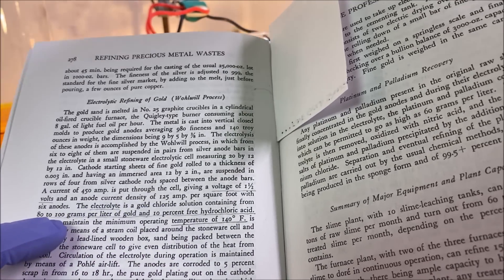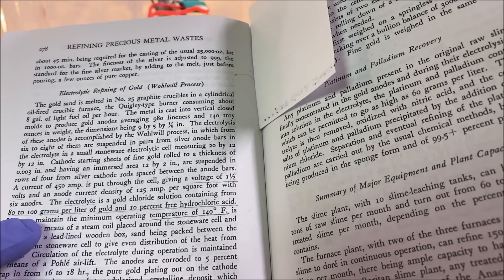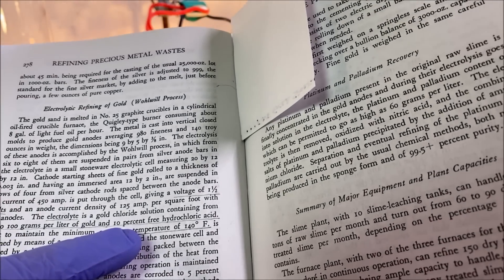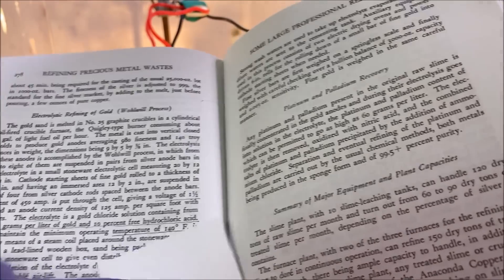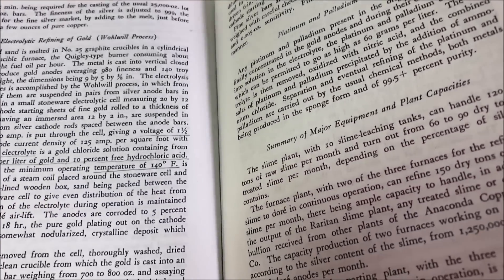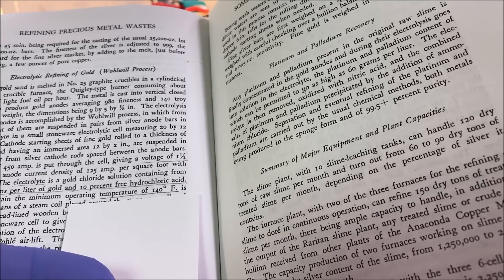The electrolyte is a gold chloride solution with 80 to 100 grams of pure gold and 10% free hydrochloric acid. We want the operating temperature up to 140 degrees Fahrenheit, which is 60 degrees Celsius.